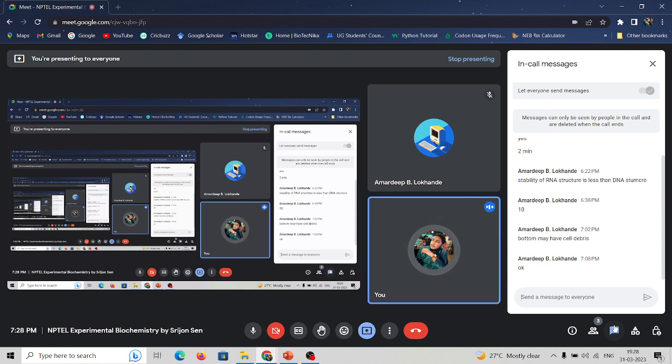Because when we order the primers, we check the Tm, or the melting temperature, of these primers, and depending on that we set the annealing temperature. So what would be the annealing temperature if the Tm of your primers is 70? Tell me.